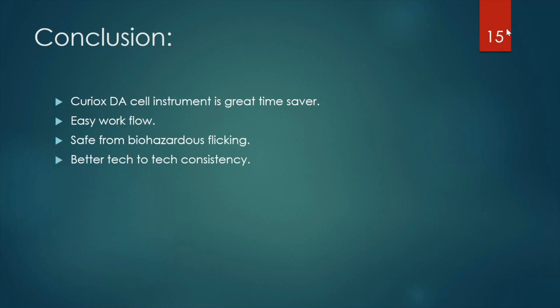I don't know how long these air bubbles will take to burst and the antibody becomes available. I don't know if cells could be sticking to the walls of the wells in the plate, with regular methods. So there is room for variability there while you're adding and mixing. And in case you're trying to remove the residual volume manually, there's room for variability there also.